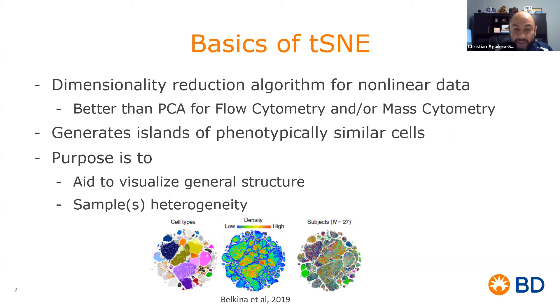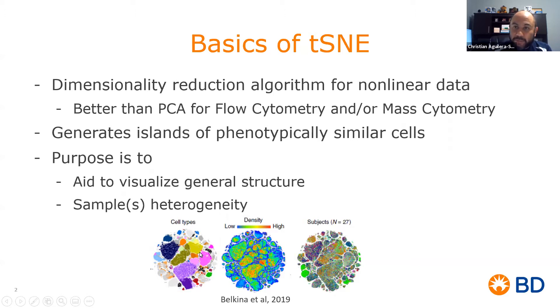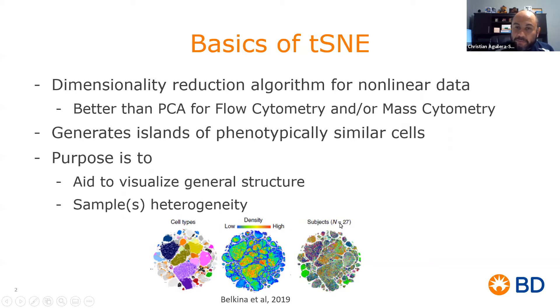As shown in this illustration we have a t-SNE map with multiple islands as shown here by my cursor, or this same map demonstrating the different cell types demonstrated by different colors, or also telling us that this t-SNE map is composed of 27 different subjects.